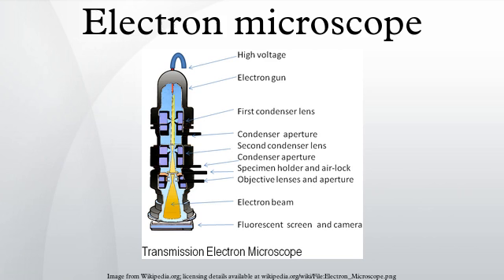Therefore non-conductive materials require conductive coating. Low-voltage mode of modern microscopes makes possible observation of non-conductive specimens without coating. Non-conductive materials can be imaged also by a variable pressure scanning electron microscope. Small, stable specimens such as carbon nanotubes, diatom frustules and small mineral crystals require no special treatment before being examined in the electron microscope.